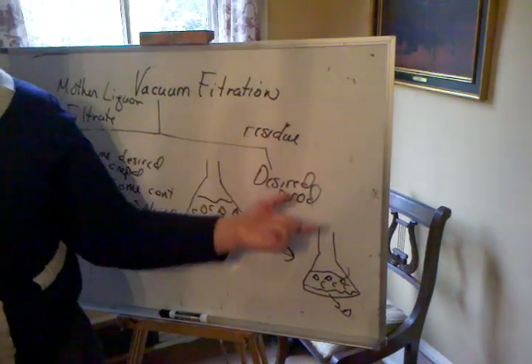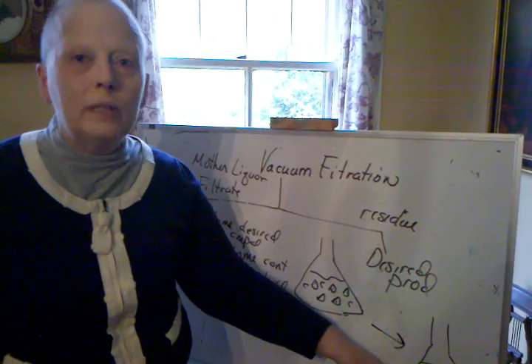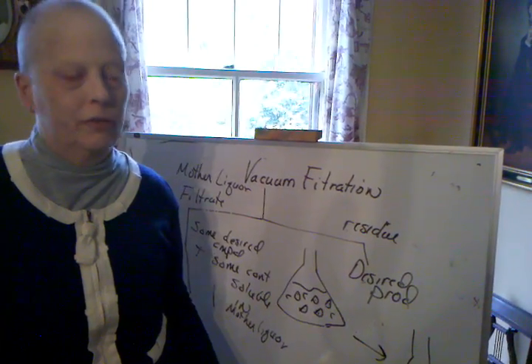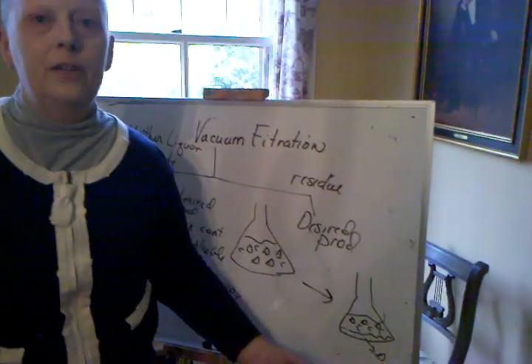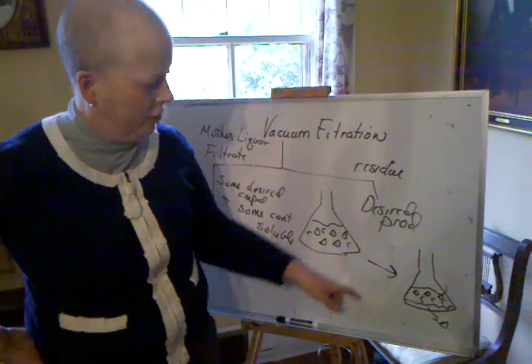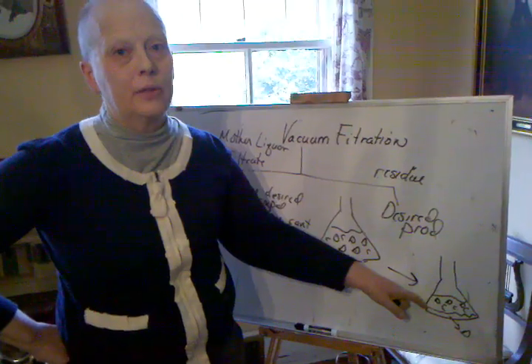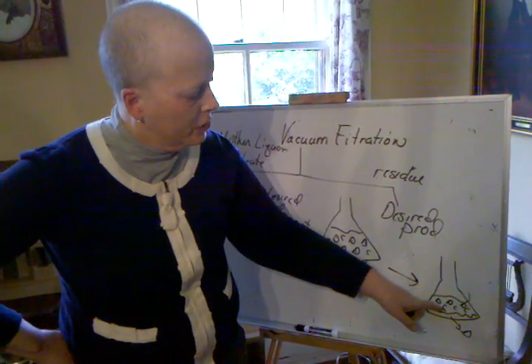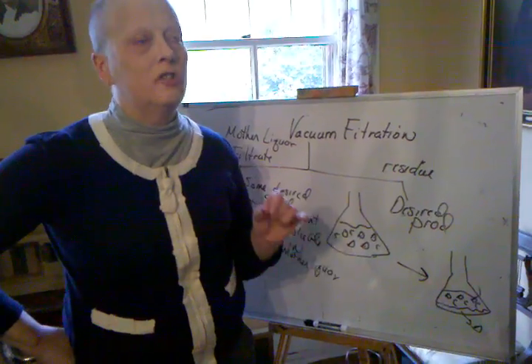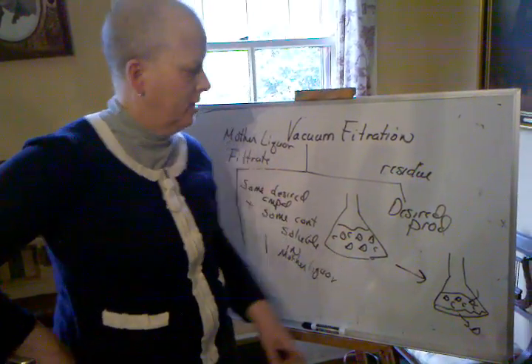If it's soluble when it's hot, it's going to still have some solubility when it's cold, and you're only getting the excess out. It's kind of like solubility product in general chemistry. You're just getting the excessive D molecules. You're exceeding the solubility limit of the cool solution. And there will be plenty of D molecules left behind. You lose a lot on a recrystallization. But what you're hoping is there's so little contaminant, or the contaminant is just so much more soluble in that solvent that it'll stay in solution, okay?